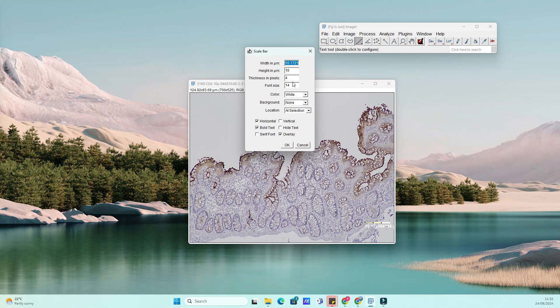Great. Now that the scale is set, it's time to add the scale bar. Go to Analyze, then Tools, and select Scale Bar from the drop-down menu.